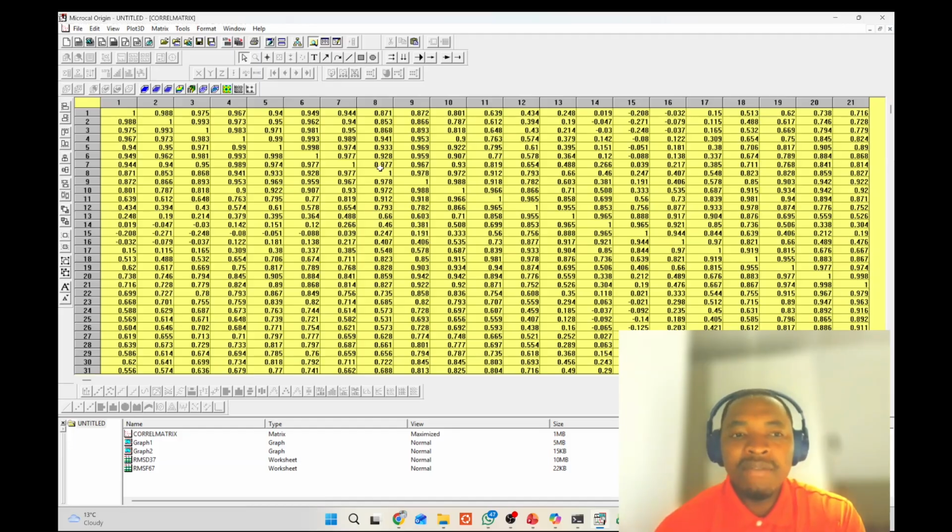Now, one other thing to note about a matrix is that there are a few configurations you can make. For example, with this matrix, I can decide, I know how many residues are available in this particular protein. Because if I make a plot directly like this, it will not be able to fit into the axis that the plot is going to give me. Now, look at what I'm saying.